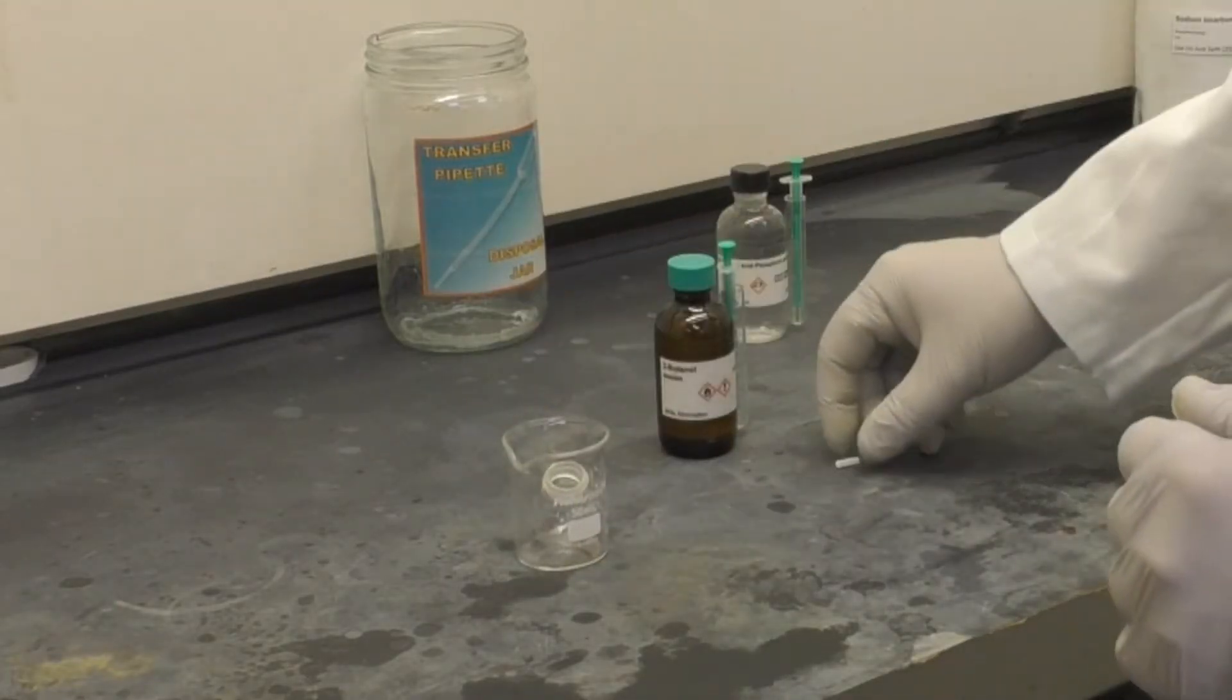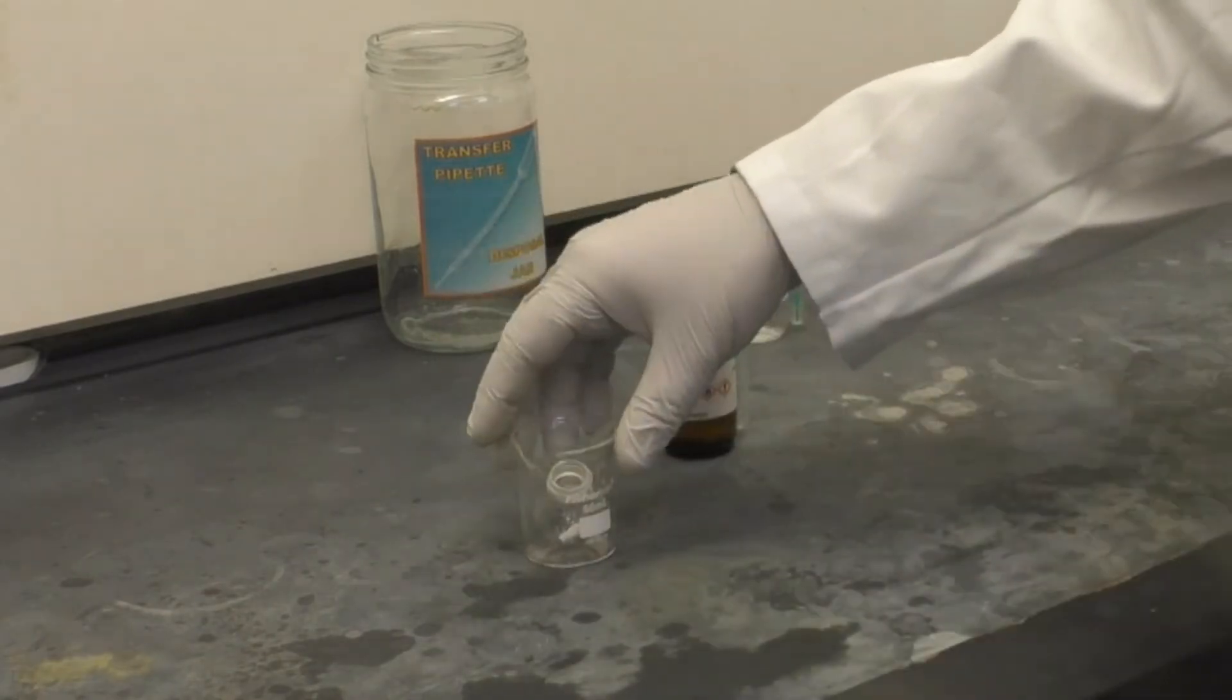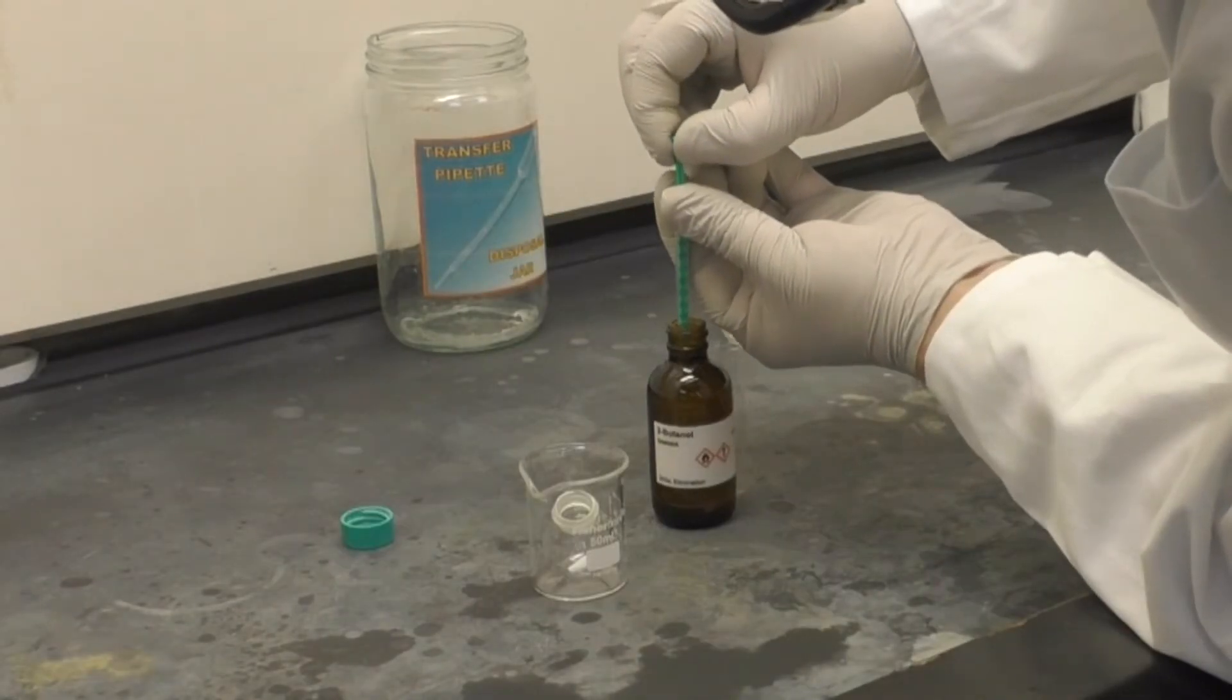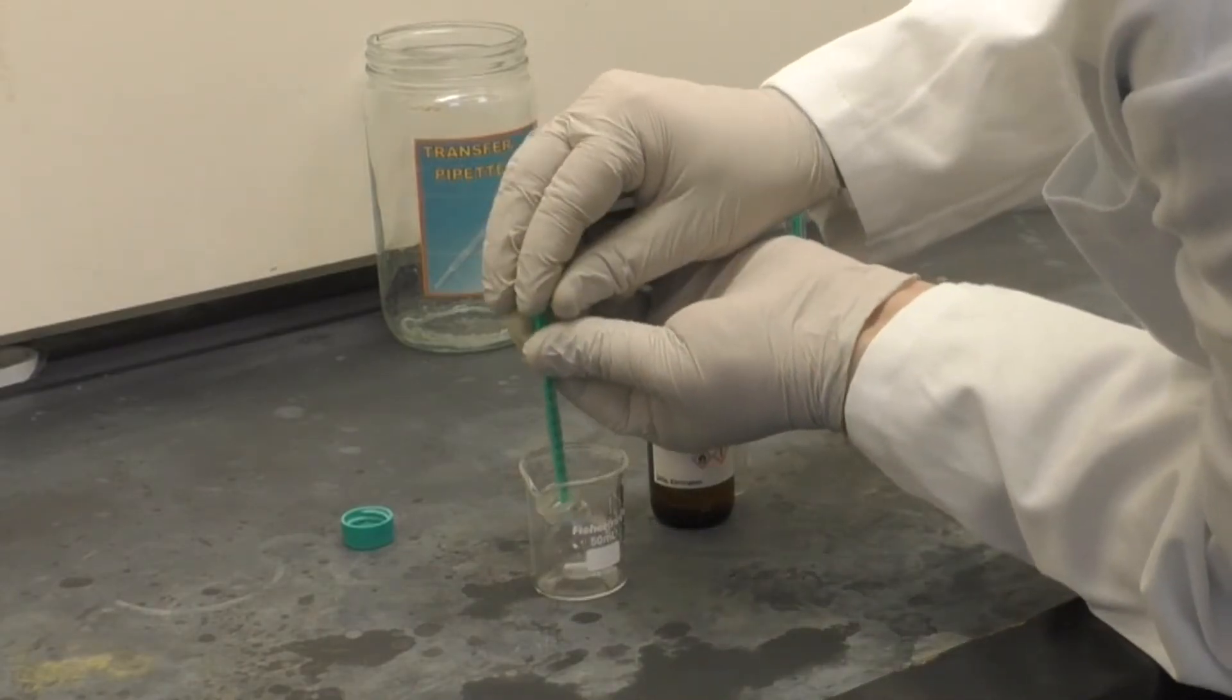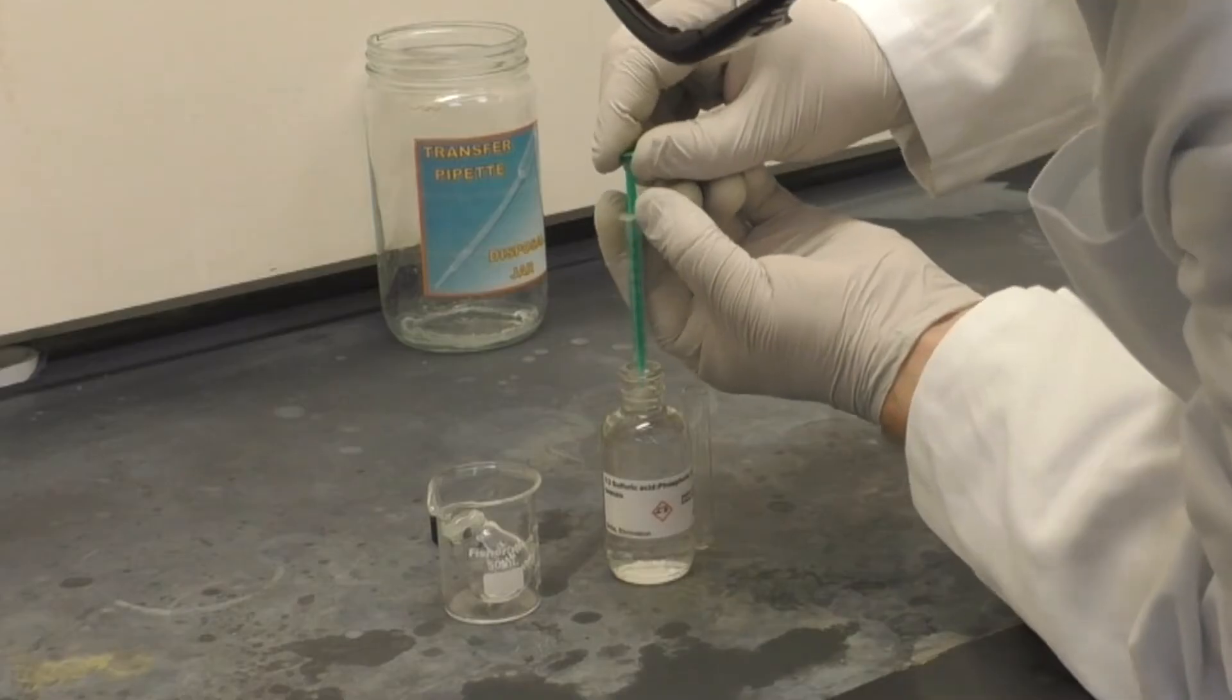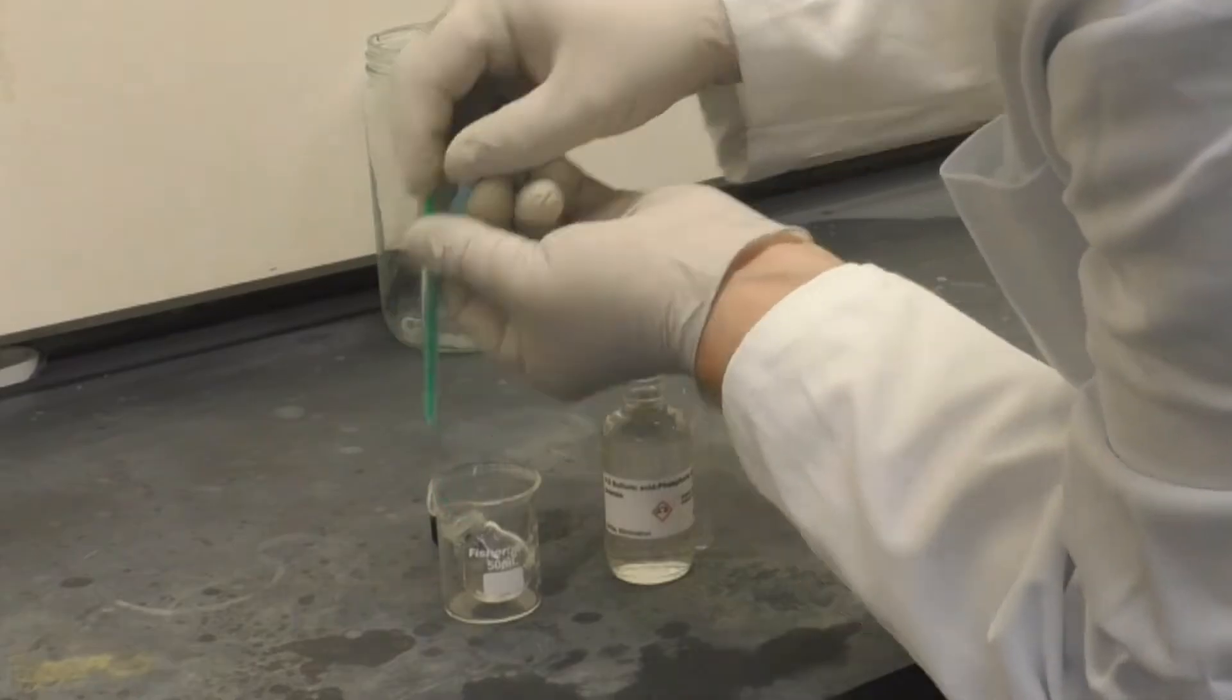Next, using a 50 ml beaker to hold your 10 ml round bottom flask, add a stir bar. Then add 0.4 milliliters of 2-butanol and 0.6 milliliters of the phosphoric-sulfuric acid mixture.